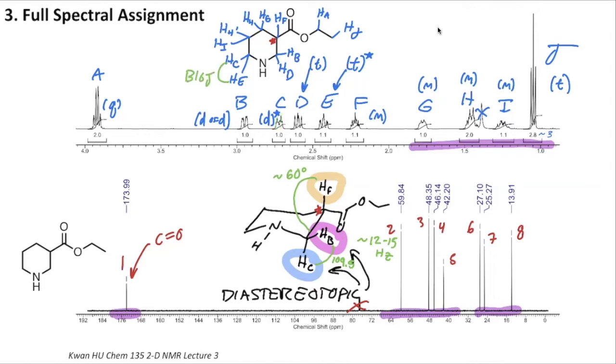And then H prime and I will be splitting HC to some extent where they are actually looking pretty similar, so that it looks like we have E as one neighbor and H prime and I as two neighbors that are quite similar. So that's where I think we're seeing those two splitting together to give a triplet.